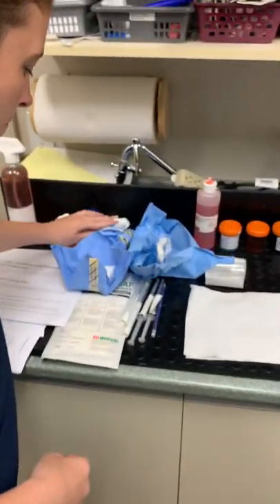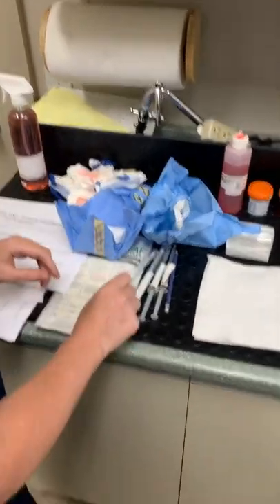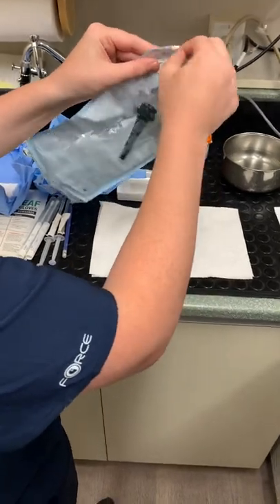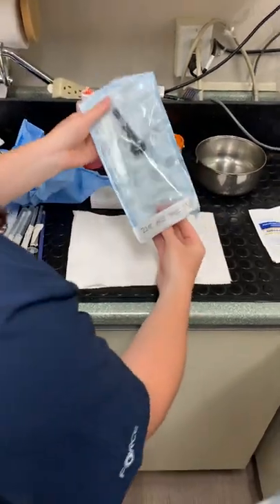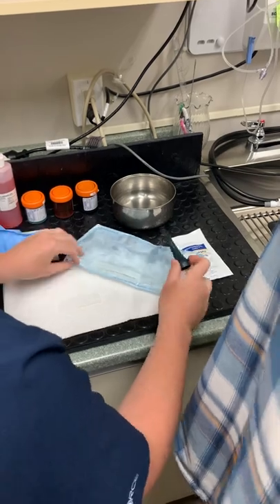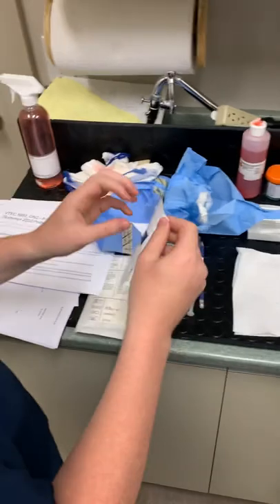Now we've prepped the area, so I will need a sterile swab, and I will use this otoscope piece as a speculum to open this.